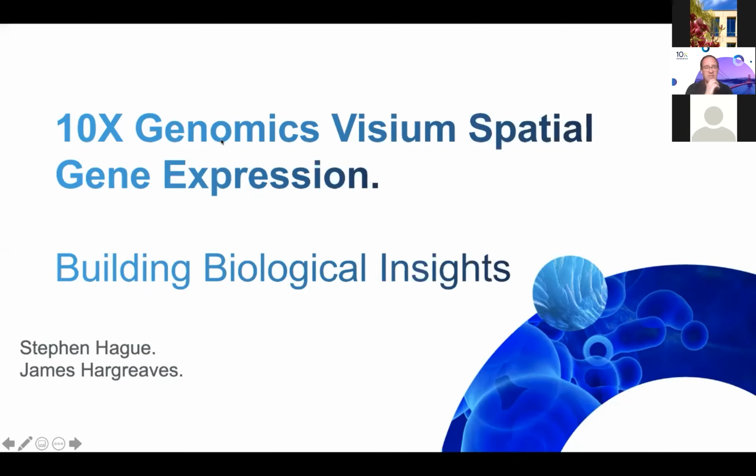As Paolo said, I just wanted to introduce a little bit of a flavor of what we've got at the moment with 10x Genomics and some of the trends that we're seeing in research, some of which we've already seen. Then I'll introduce where we're going, both with the Visium platform and ultimately with in situ as well.